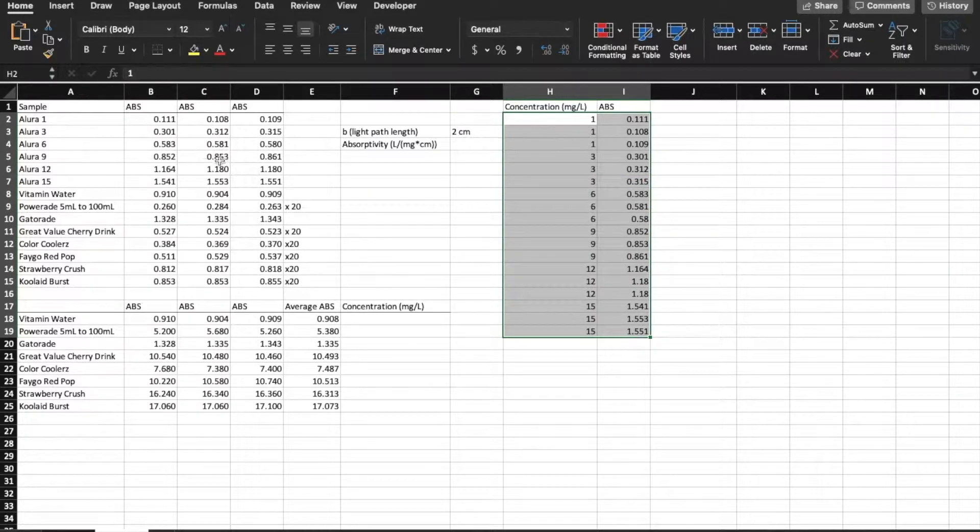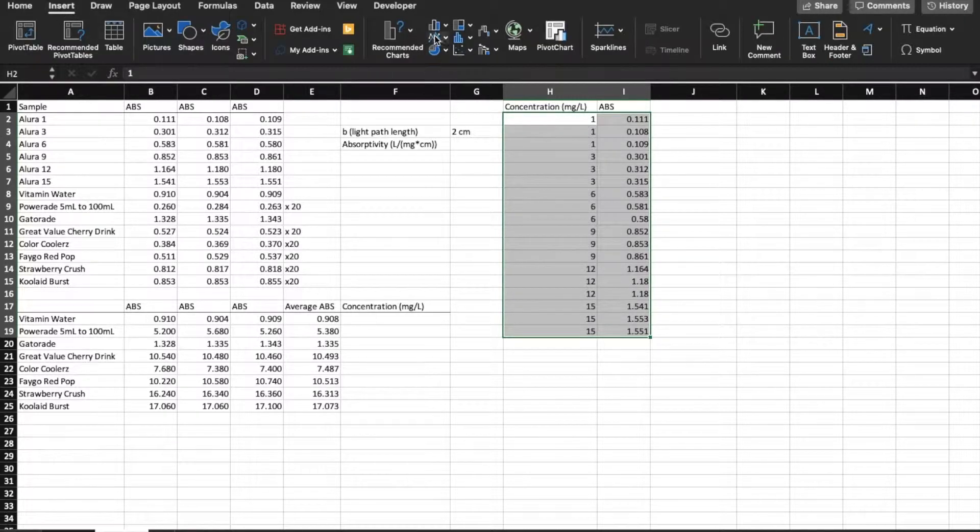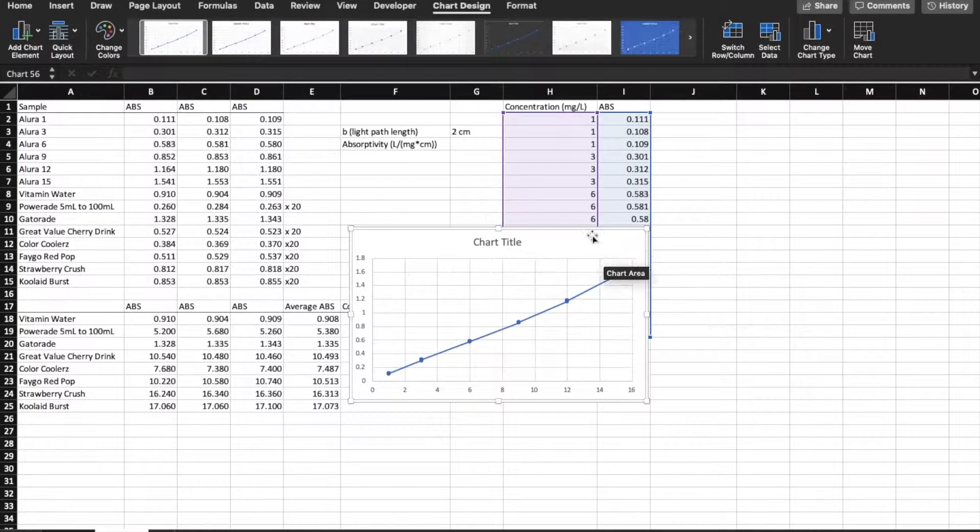First, all I did was move the concentrations for the stock solutions over to the right just in one graph so that I can easily graph it. So I'm going to highlight the data, insert a scatter plot.